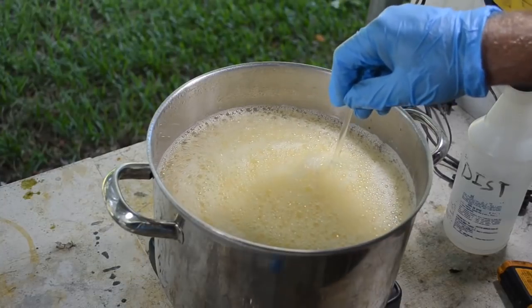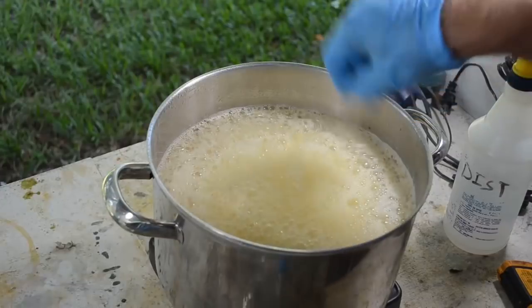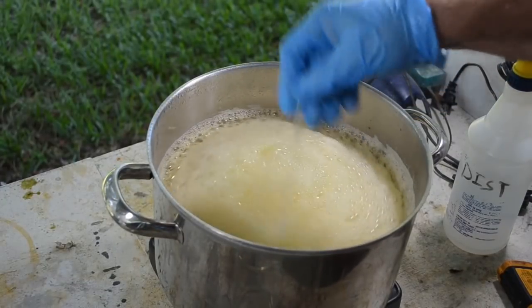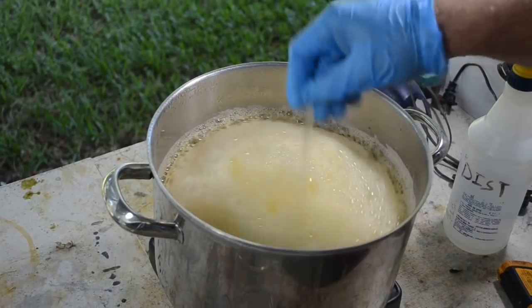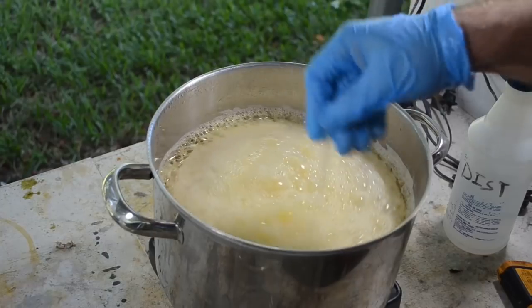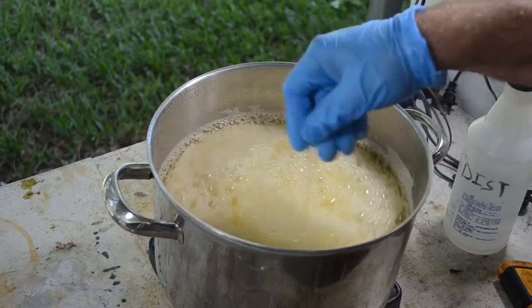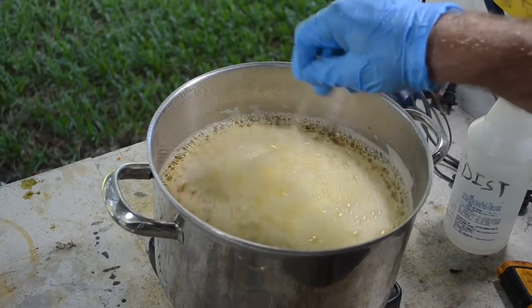I've still got, I don't know, around 100 milliliters of the original beaker of acid here. I may still need to mix up more, but I would say we've probably made a significant change in the pH based on how much foaming is going on right now. Well, let me beat this foam head down a little bit and then measure the pH again.